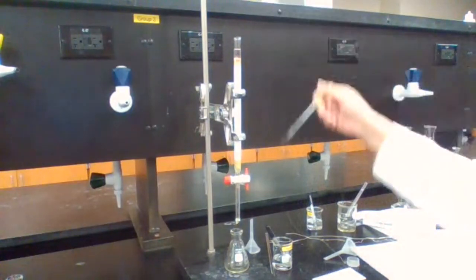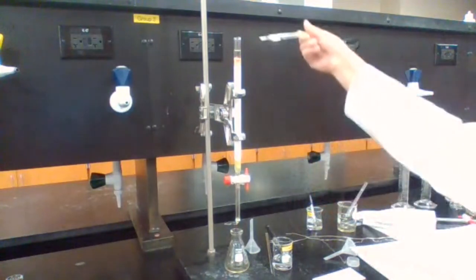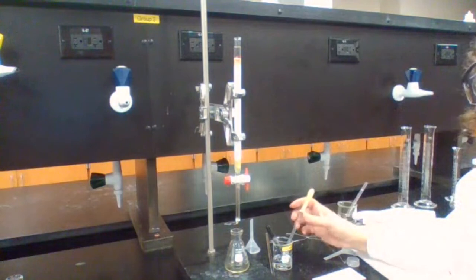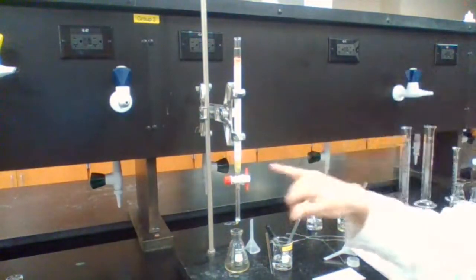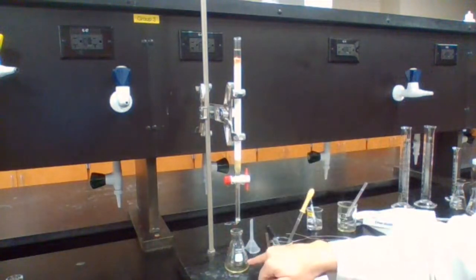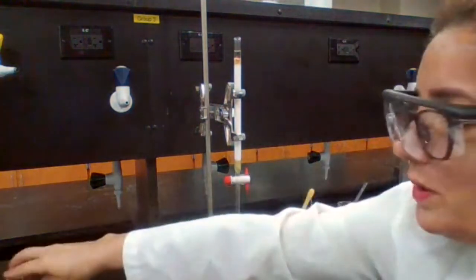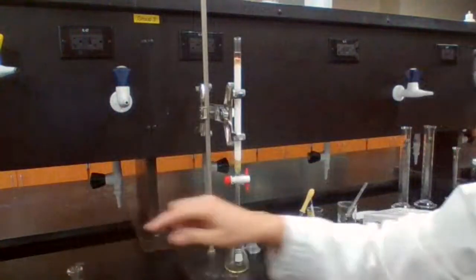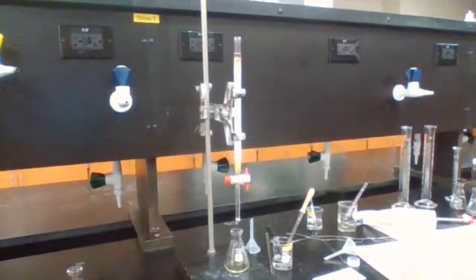I know when to stop collecting. Until all the yellow band has been removed. Perfect. When the yellow band entirely is eluted into fraction 2, I stop adding acetone. Then I have my fraction 1 collected already, which is my fluorene in one flask, and the fluorenone in the second flask.